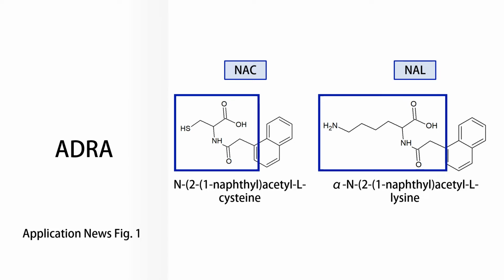ADRA offers advantages over DPRA. For example, it enables analysis at 1% concentration and detection at 281 nanometers, a wavelength which is relatively insusceptible to impurities.